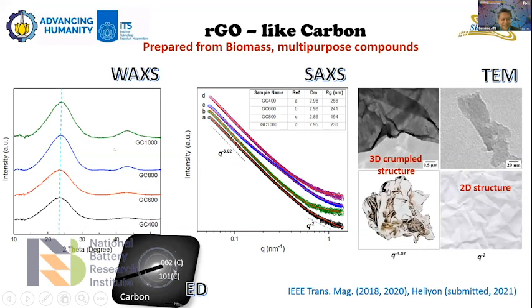So this is the intensity, this is 2 theta, until maybe 60 to 70 degrees. Yeah, and there are two peaks here. And when we compare with electron diffraction from the TEM observation, there are also two circles, not spots with dots, but circles, indicating that the sample is not single crystalline but polycrystalline, with these two peaks.